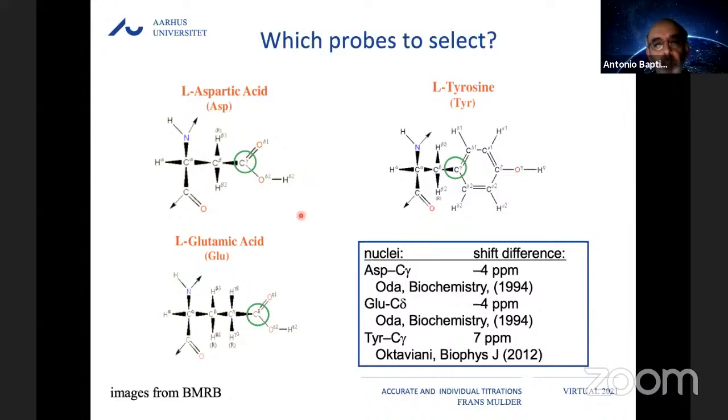When I see examples like that, I always wonder if you ever observed a case like that, even after trying to disentangle all the NMR signals like you are doing. Has anyone observed a case like that in a protein? I just know a few cases with small molecules like DTPA and stuff like that. Is this observed in proteins? Do you know about it? Up and down patterns?